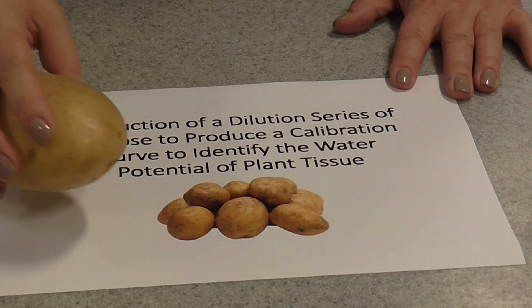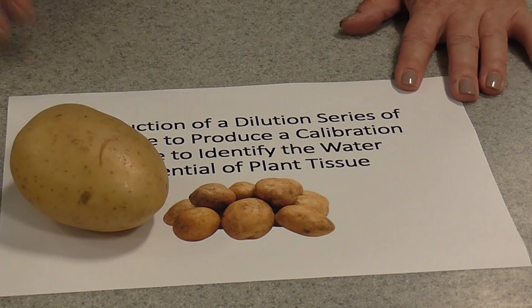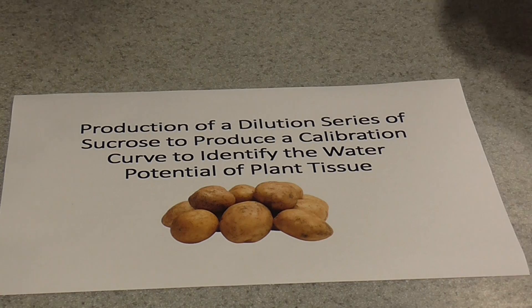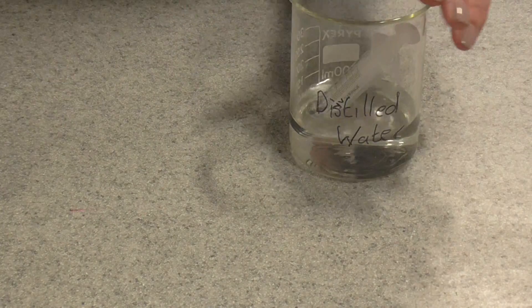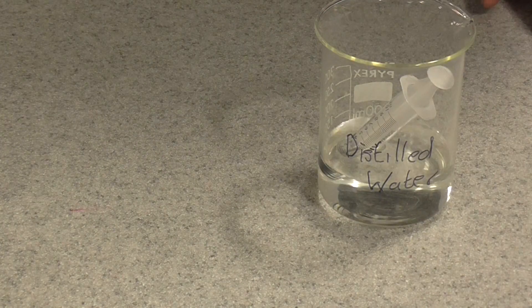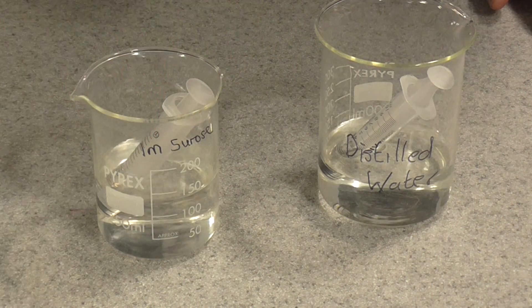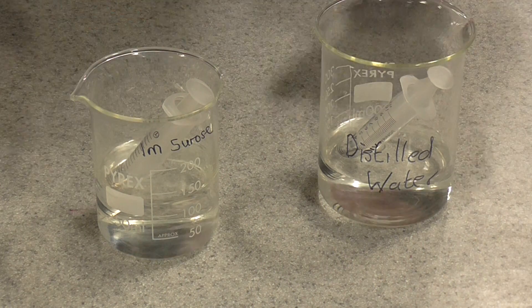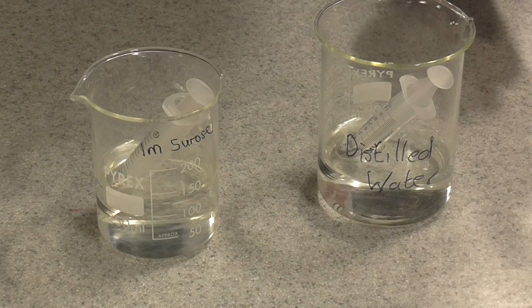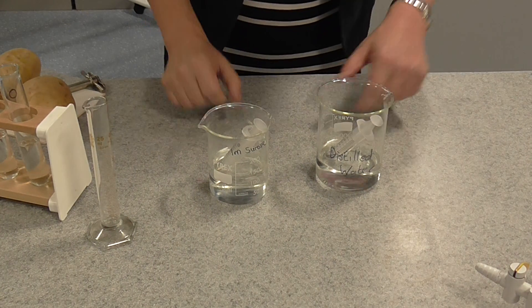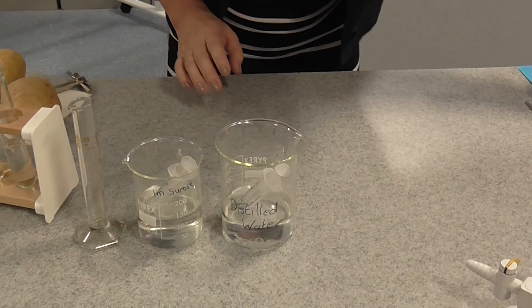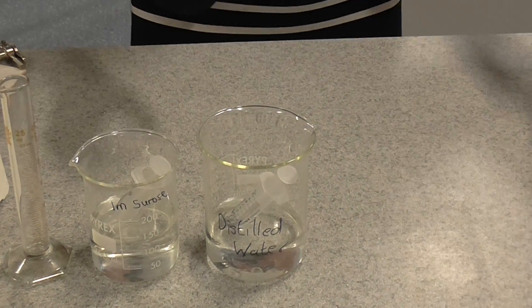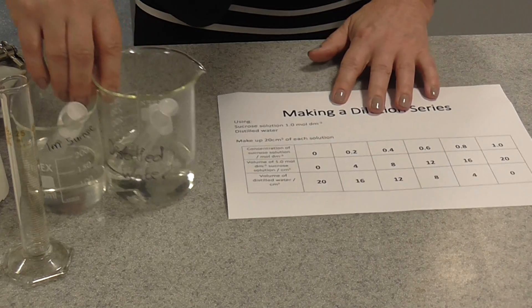The plant tissue we're going to use is potato. The first thing we need to do is make our dilution series. For this we need distilled water and a one mole per decimetre cubed sucrose solution which the technician has prepared. You can use measuring cylinders or ten centimetre cubed syringes. We're going to make up twenty centimetres cubed of each of a number of different solutions.